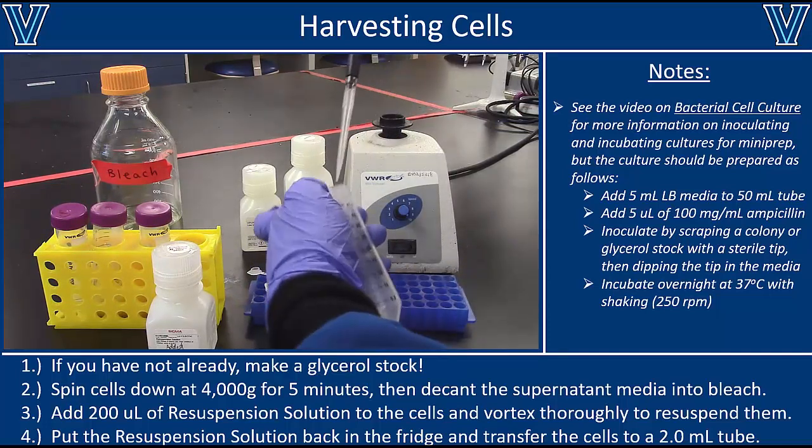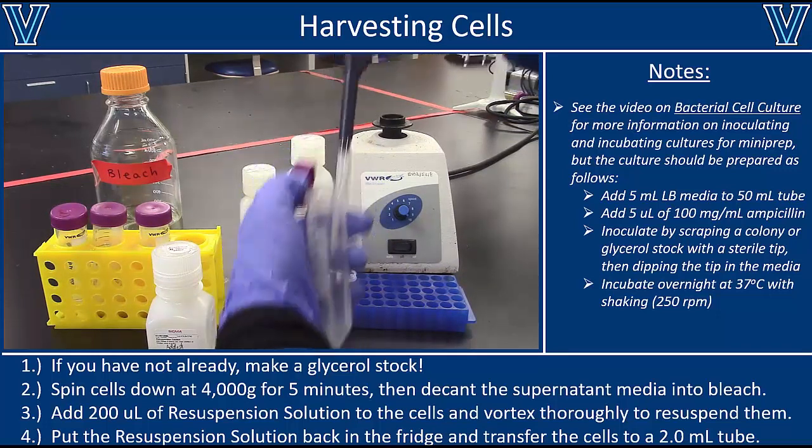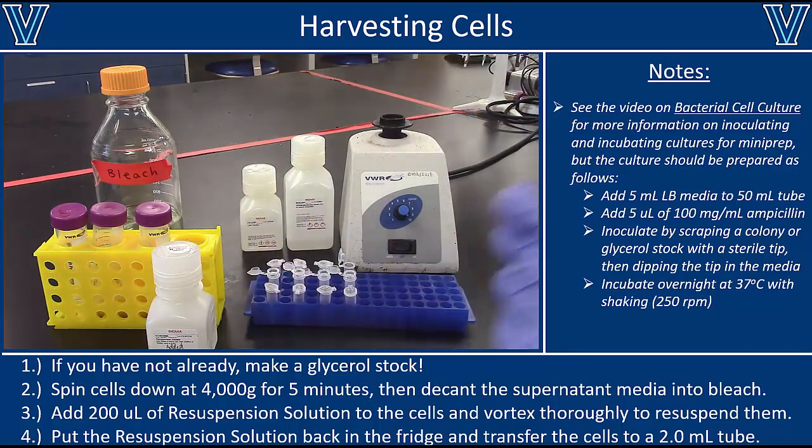Just every subsequent step here is a lot easier if you're working in a smaller tube as opposed to a 50 ml tube, so that's why we're transferring them at this point. You can then throw away that 50 ml tube and repeat this for the rest of your samples. Also, please, please, please, put the resuspension solution back in the refrigerator immediately, just so you don't forget to do it later. It needs to go back in the refrigerator so that the RNase A does not degrade.